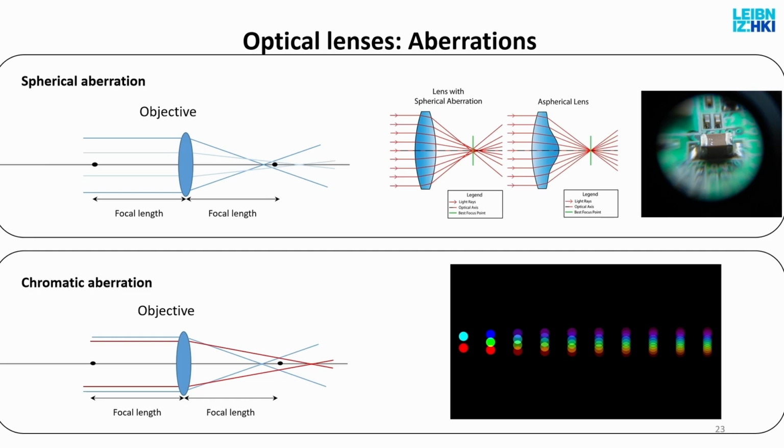So this means that light beams which come at the center of the lens will go undisturbed, but the further you go, the closer the focal point is. So a realistic light beam will not be focused in one focal point, but in a focal line that sits on the optical axis.